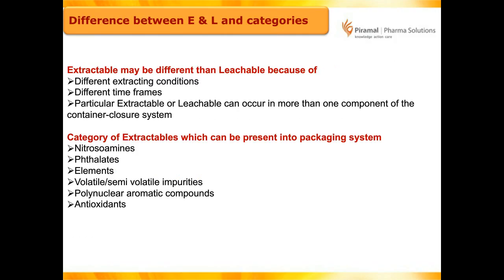Coming to slide 5. What is the difference between extractables, leachables, and their categories? The extractable may be different from the leachable, because under different extracting conditions we can get different components coming out from the packaging material. So your extraction condition plays a very important role.